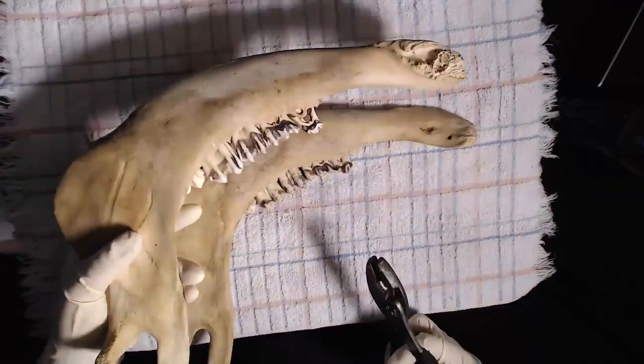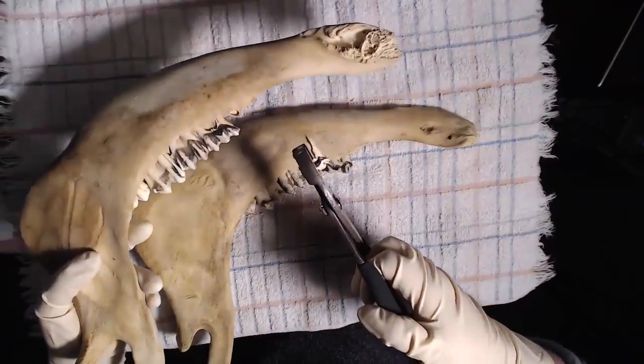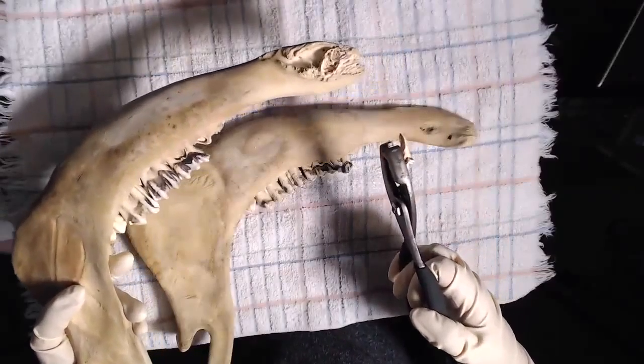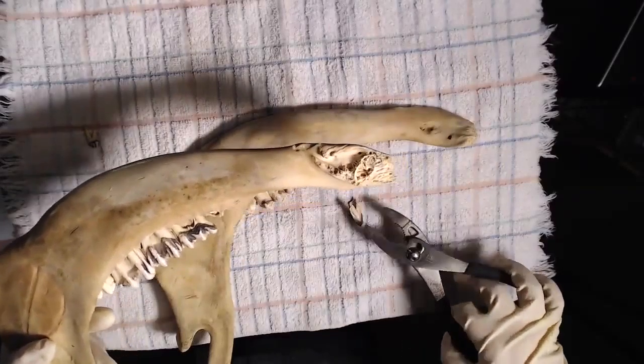Here's another jaw so you can kind of see. I'm going to pull this one here. That's how it should look when you pull out your teeth.